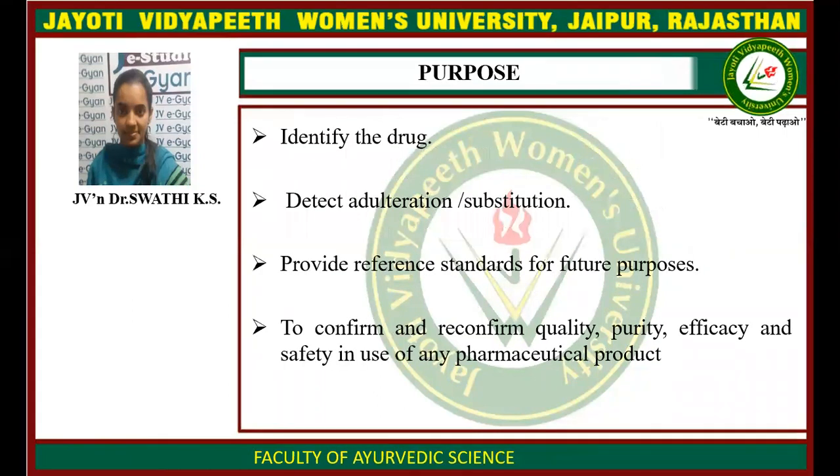The purpose is to identify the drug and detect adulteration as well as substitution, and provide the reference standards for future purposes, and to confirm and reconfirm quality, purity, efficacy and safety in use of any pharmaceutical product.